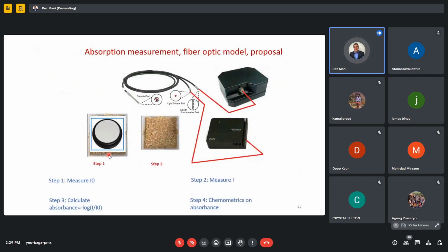But typically what we use the fiber model for is a reflection probe. A reflection probe has two inputs and one output. The input with the linear shape goes to the spectrometer. The other input, with the circular shape, goes to the light source, a 5 watt halogen lamp.